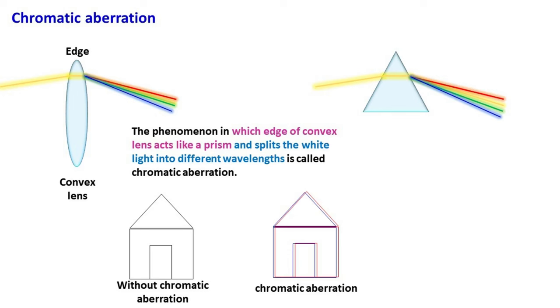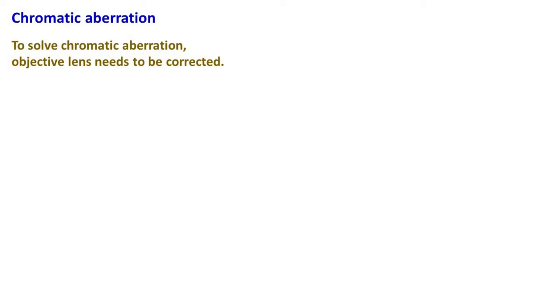The problem of Chromatic Aberration is seen in microscopes as well as optical instruments like refractive telescopes. To get images without Chromatic Aberration, the objective lens has to be corrected.